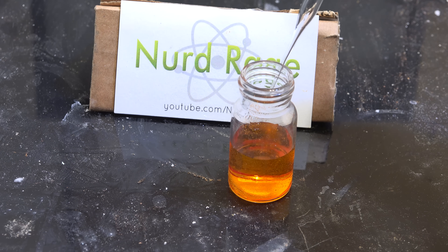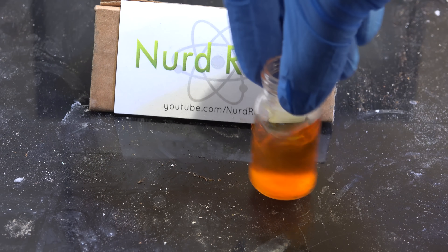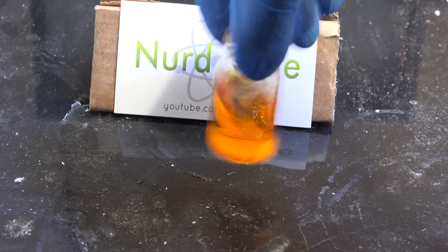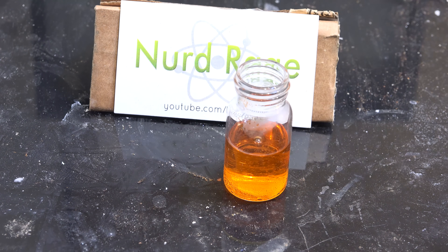While amateurs mostly use low-grade drain cleaner acid, it helps a lot in this case to use the highest quality sulfuric acid you can get. When doing any sort of analytical work, you should use high-purity test solutions so the impurities in the solutions don't interfere with whatever you're testing. And there's your test solution.